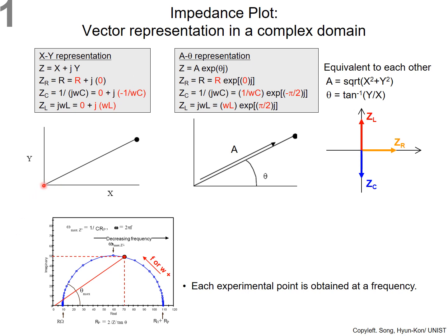It should be negative because capacitance is always positive and the angular frequency is always positive. So the y value of the capacitor should be negative.